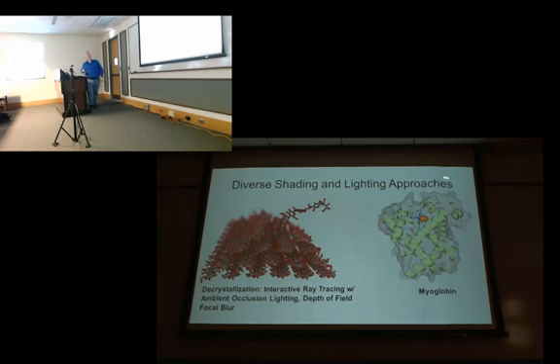And then you can do other things where, like this one, we really didn't use any shadowing at all. This is basically using no shadowing and a conventional transparent surface that's extremely transparent, and you can just barely see that it's there, and it doesn't obscure the interior at all. So this is more like what you would do with OpenGL. And in fact, with a high-quality OpenGL GPU, you can generate this kind of image in VMD interactively. So it isn't that it's impossible, it's just challenging. You have to put some work into it to get a good figure the old-fashioned way.